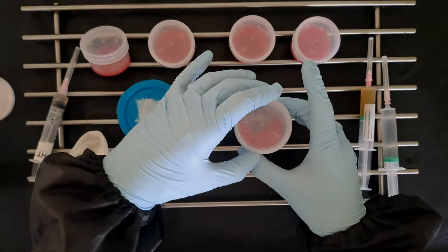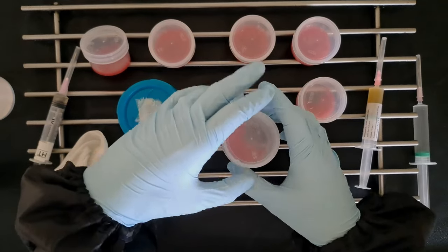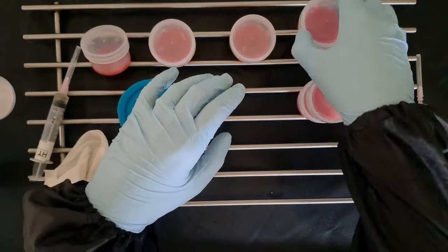Position your items inside the still air box carefully, loosen all the lids off the top of the pots, and then inoculate each separately.